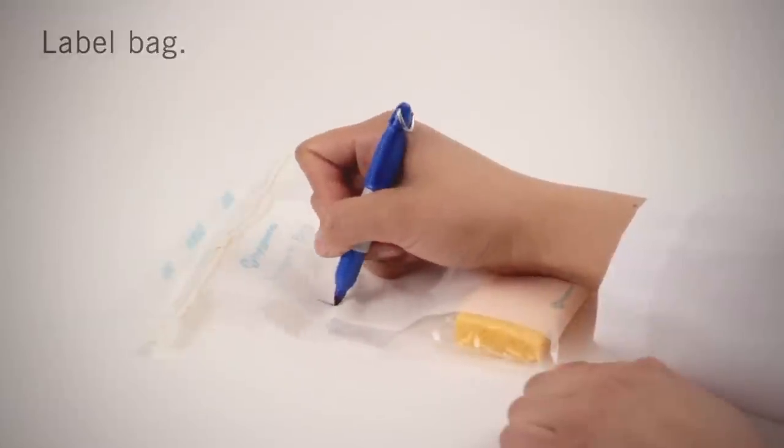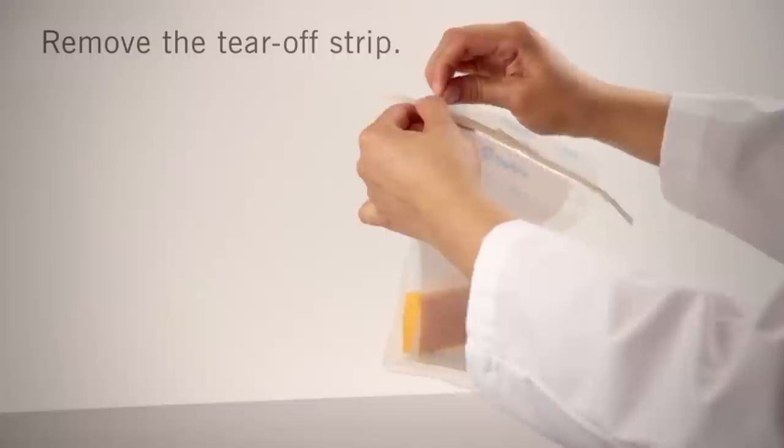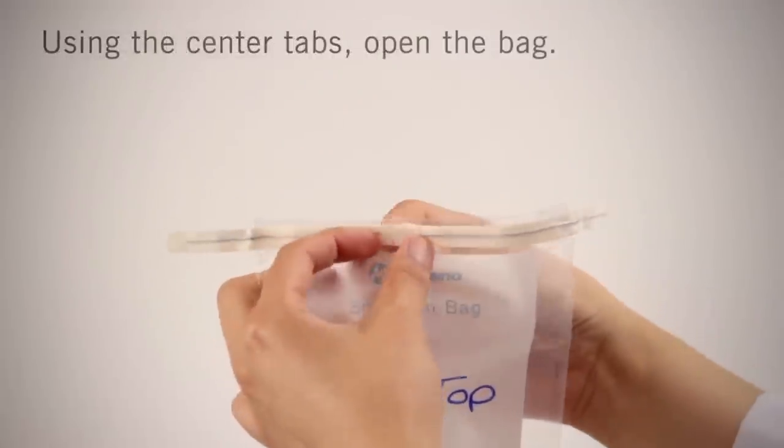Label the sample bag with permanent marker for identification. Remove the tear-off strip. Using the center tabs, open the bag.